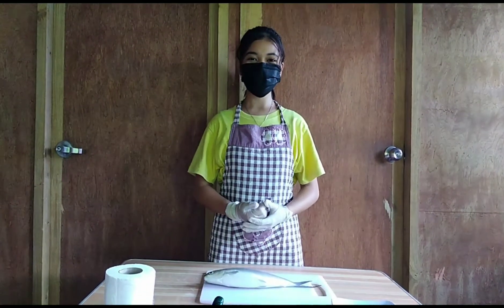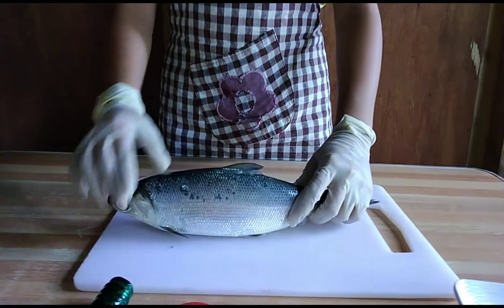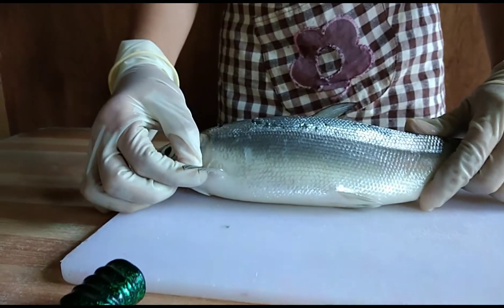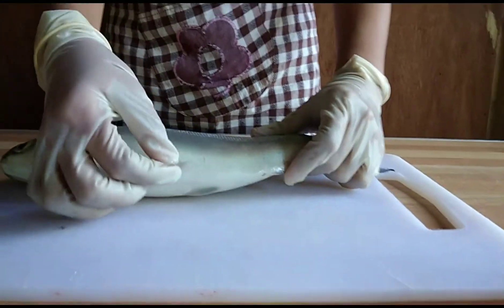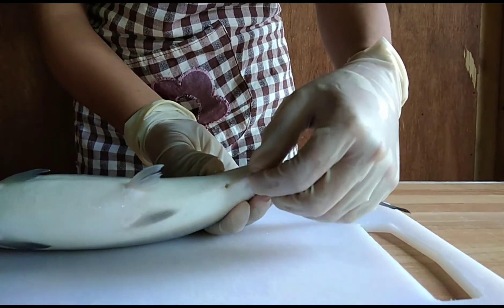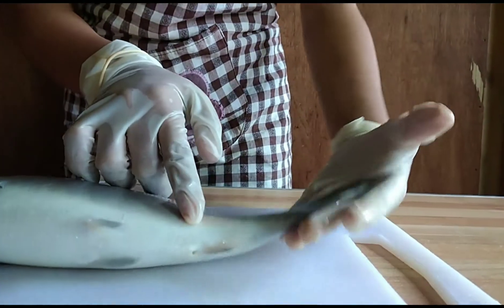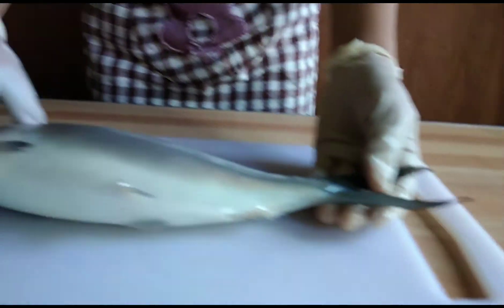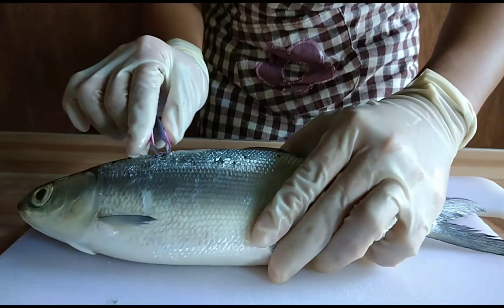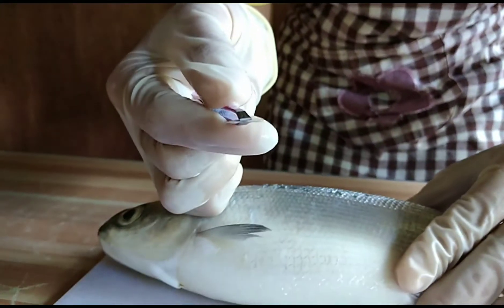Now I am explaining the parts of the bangus. This one is the dorsal fin, the pectoral fin, the pelvic fin, and the anal fin. It is called anal fin because it is located near the anus. And the last one is the caudal fin. This is the scale of the bangus — let me get some scale to show you.